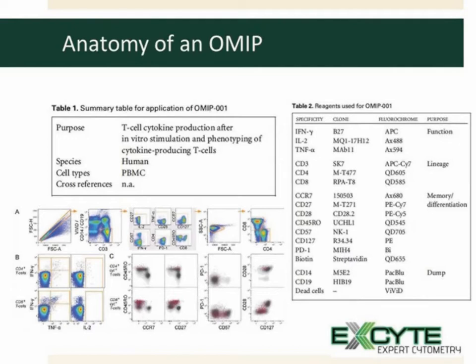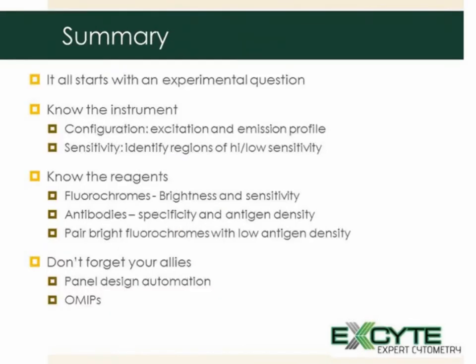The beauty of the OMIPs is that they're an ongoing, evolving process, and you can see OMIPs referring to previous OMIPs so that you can see how people's thought processes evolve to answer specific questions using backbone pieces from one OMIP or another.